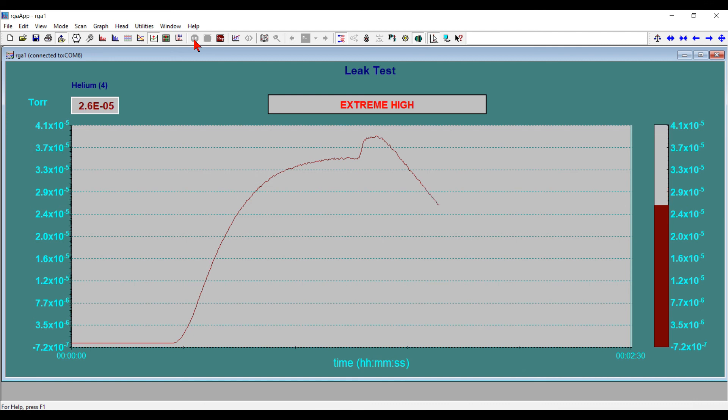Now it's starting to drop down. It's going to take some time, but the leak has been sealed. You can see that slope — it's going to take quite a while for the ion pumps to pump this out, but that drop off is about normal.